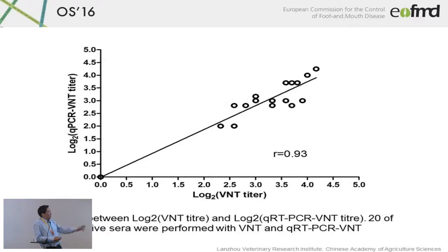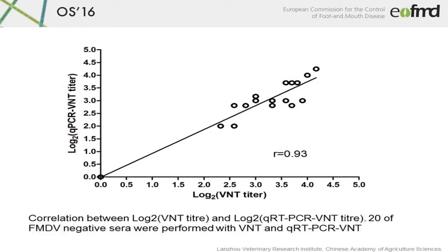And we did a little bit of correlation in terms of VNT titer and our assay titers. From here, you can see both tests are quite close to each other. But this is just very preliminary data, so we're still working on it with more samples.